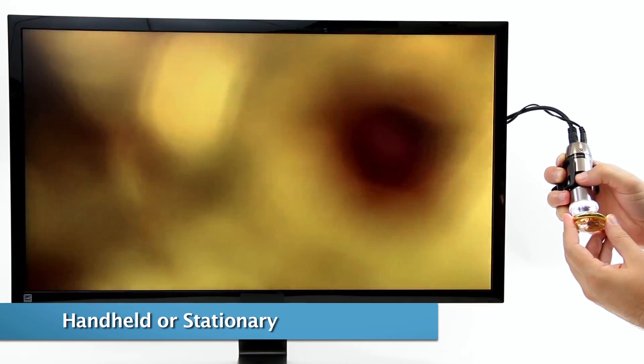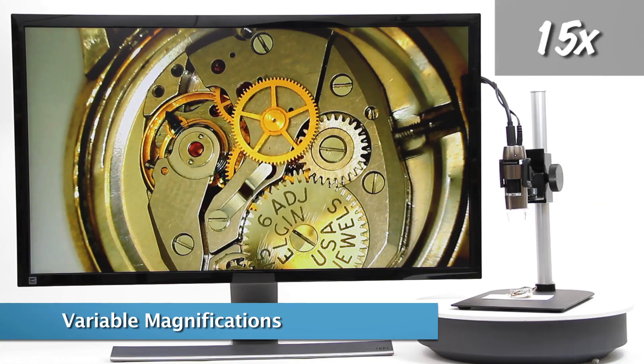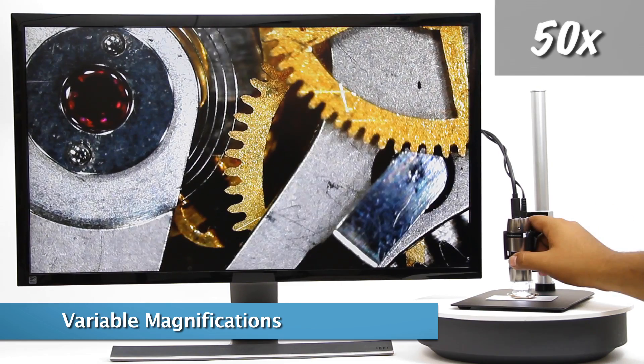The Dynolite can be easily used in a handheld capacity for viewing and inspection, or can be used in a stand for additional stability and hands-free usage.